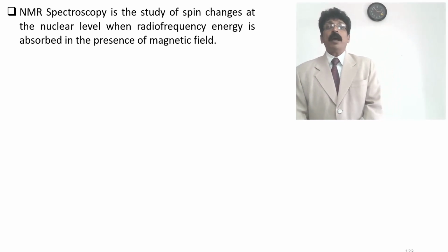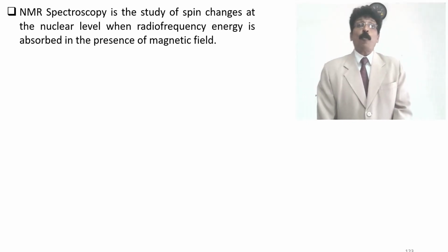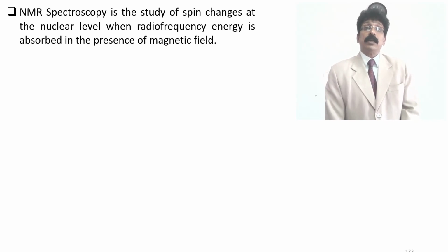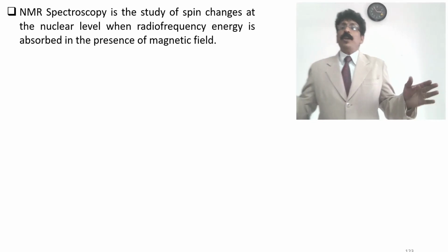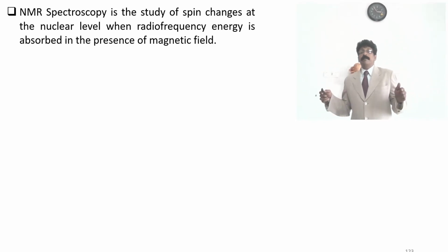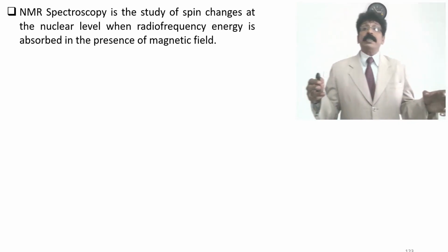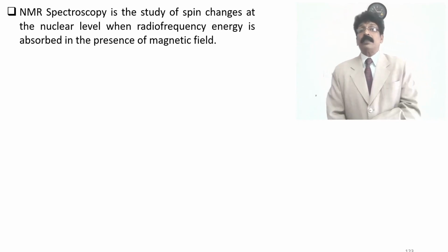NMR means nuclear magnetic resonance. NMR spectroscopy is the study of spin change at the nuclear level when radio frequency energy is absorbed in the presence of a magnetic field. When you apply a magnetic field, the nucleus absorbs radio frequency energy, and the absorption changes due to the presence of the atom, so it can be identified.